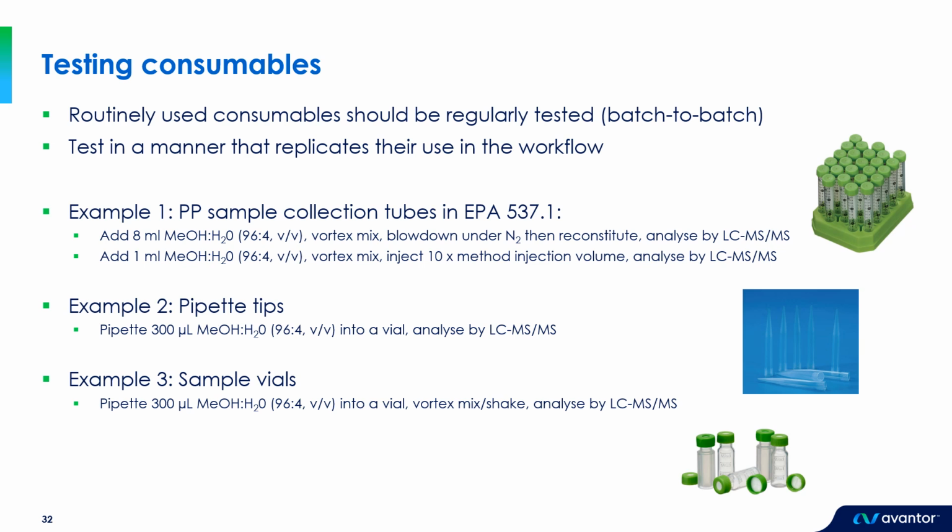Pipette tips are again absolutely crucial as we use them to transfer our samples. So the way we test those is by pipetting 96% methanol into a clean vial and analyzing by LCMS. Sample vials, again, we tend to test in the same way.